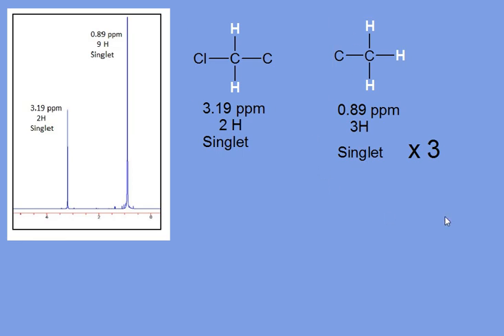Remember, when we look at the chemical formula, it's C5H11Cl. So one carbon explained, then another three, which makes four. So that neighboring carbon, which doesn't have any hydrogen, must be the same carbon to make the fifth and last carbon in the molecule.